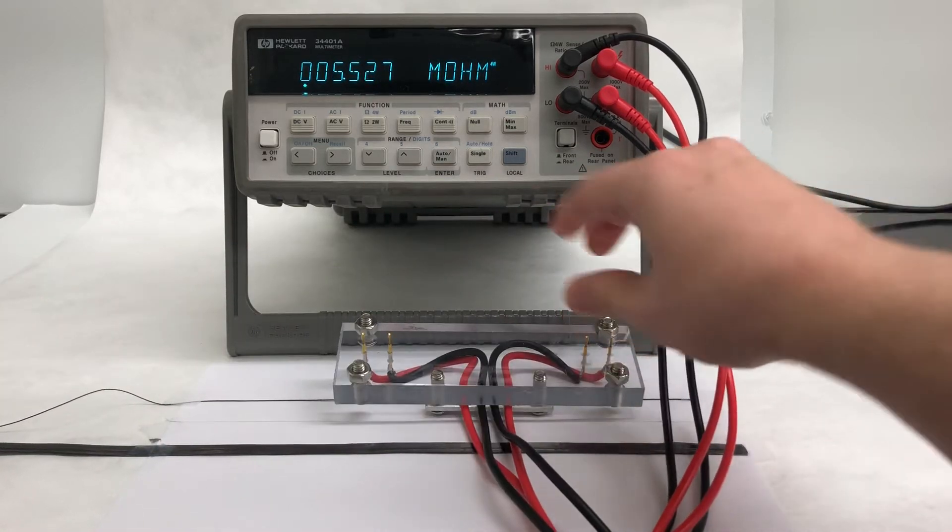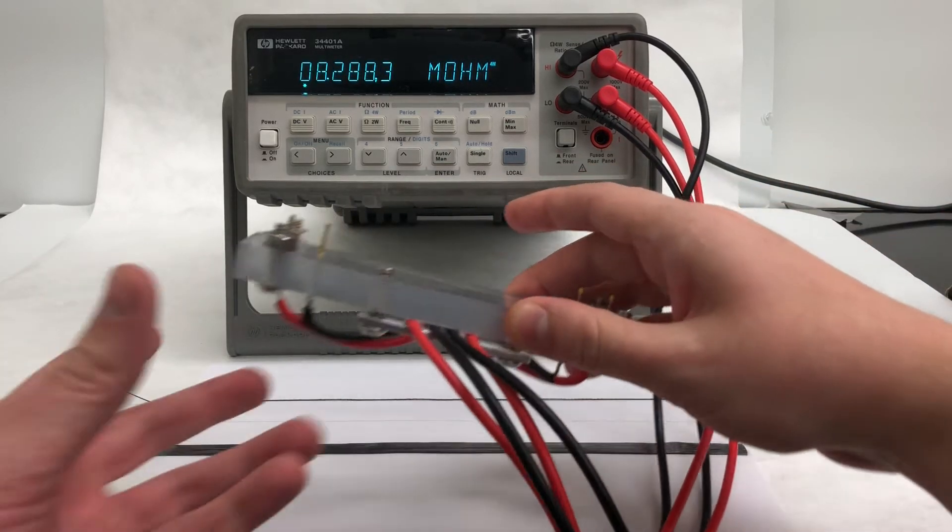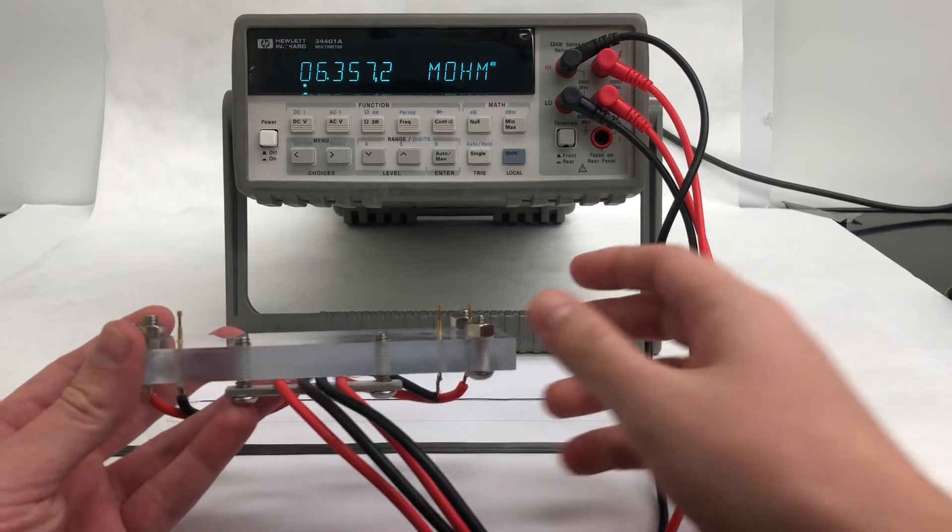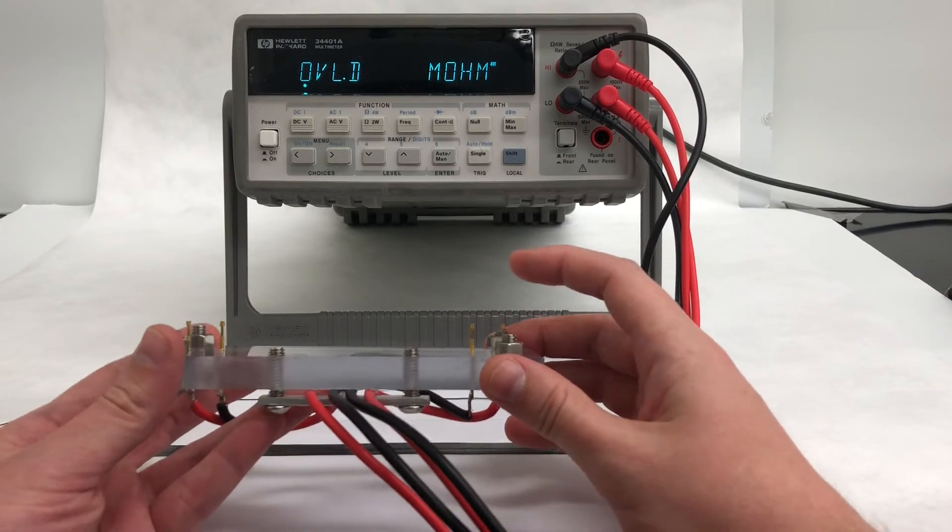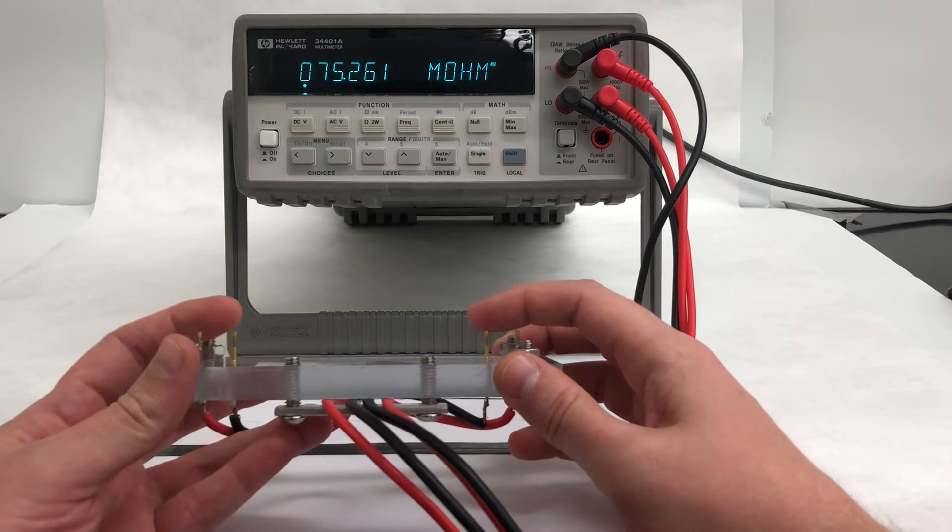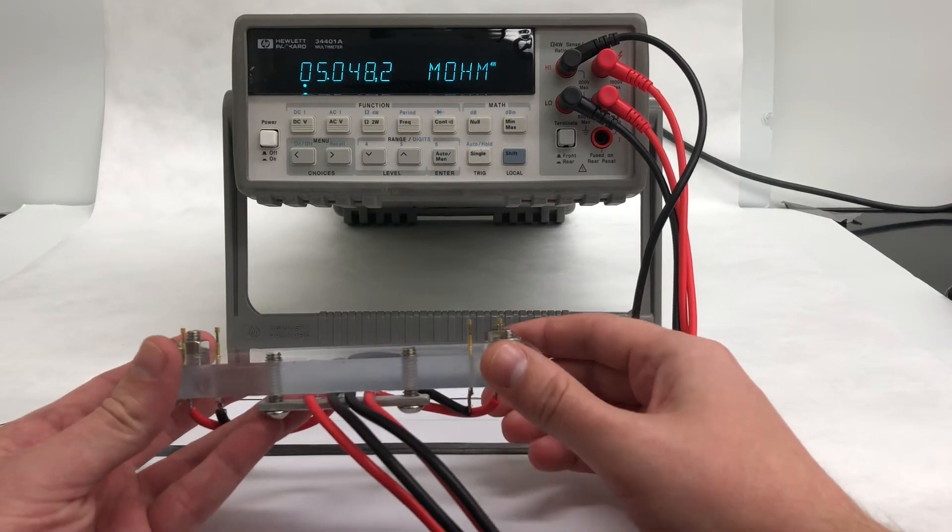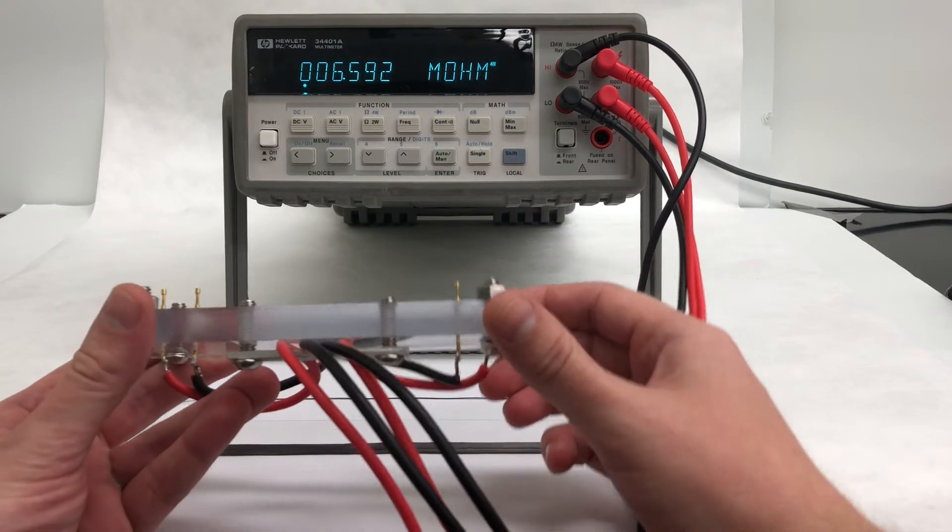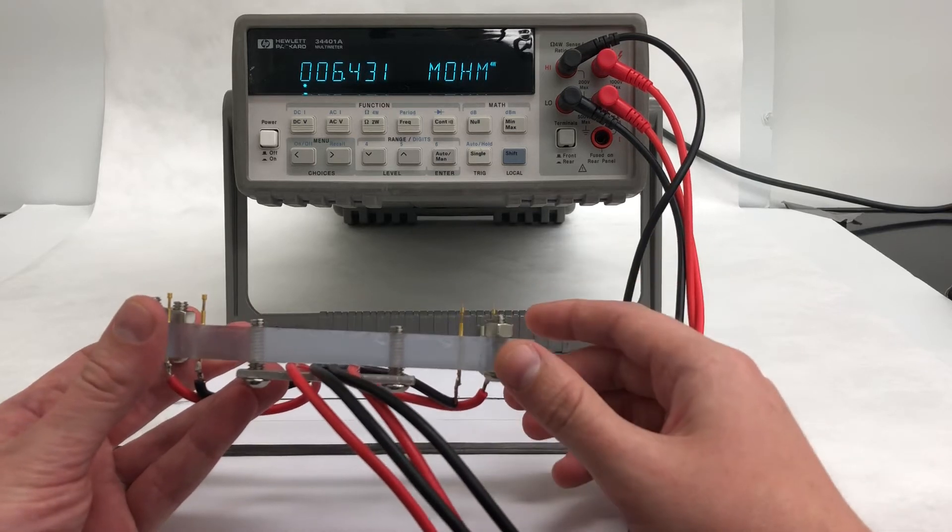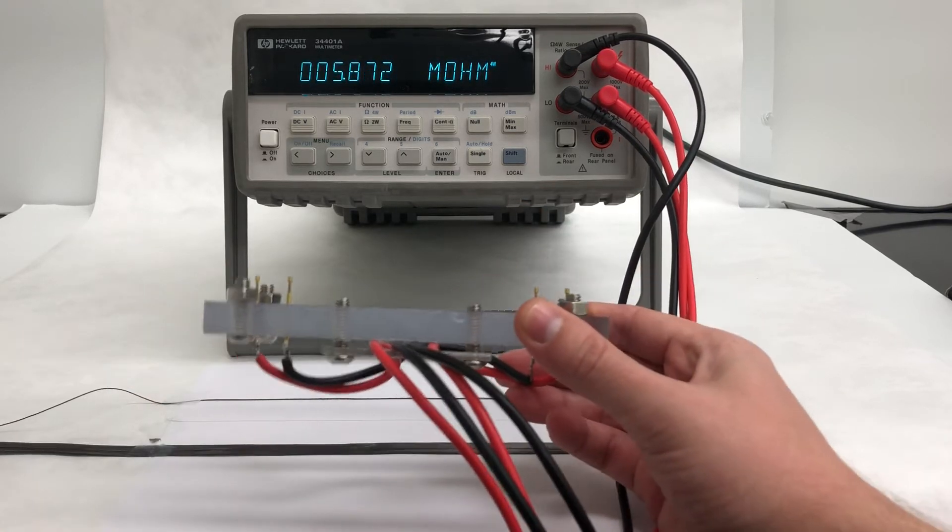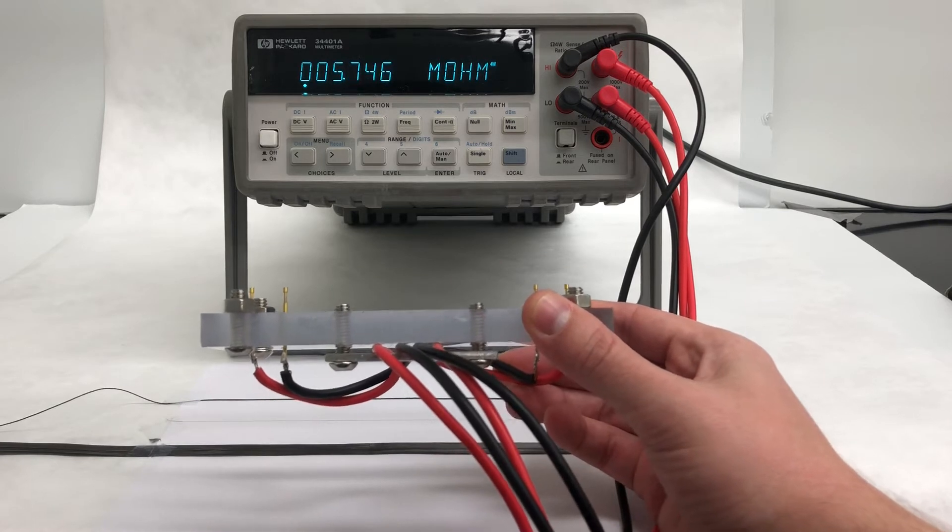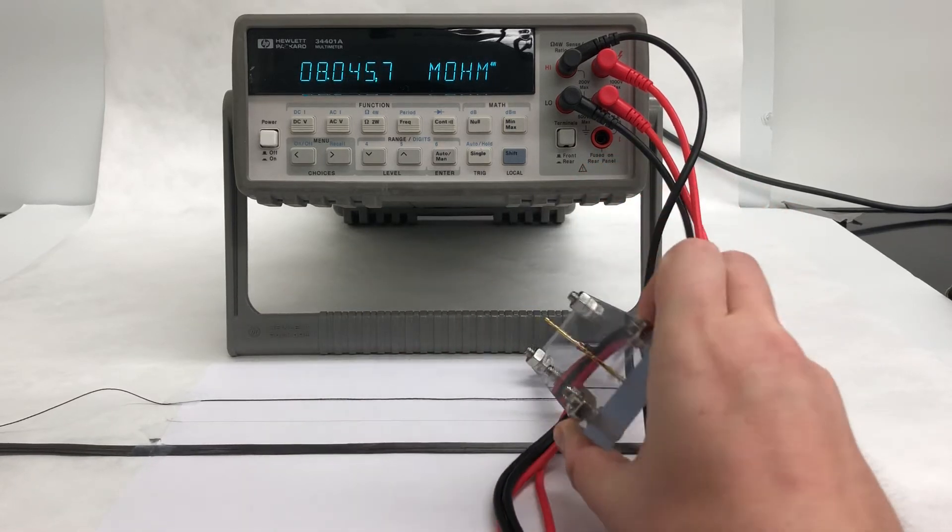In a four-point probe measurement, the outer two contacts deliver a fixed electrical current through the sample, and then the inner two probes measure the voltage drop between the portion of the sample that's between them. This allows the multimeter to calculate and display the electrical resistance of the length of the sample between those two inner pins, without having to worry about the unknown contact resistance between the metal pins and the sample.